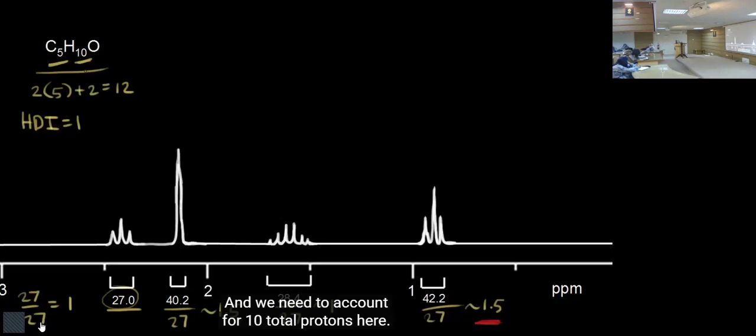Because in the proton NMR spectrum of a small molecule, most often there are some protons, specifically when we're talking about natural products. They have stereo centers. Most of the natural products that we are all working on have some chiral centers, often more than one.